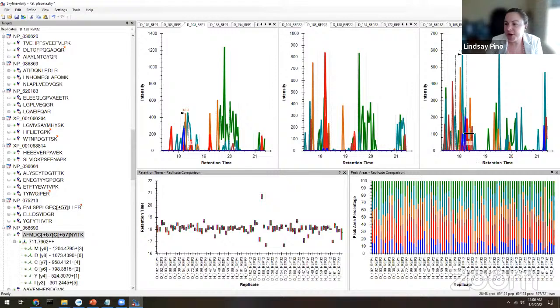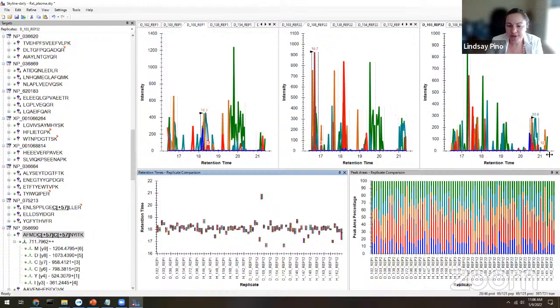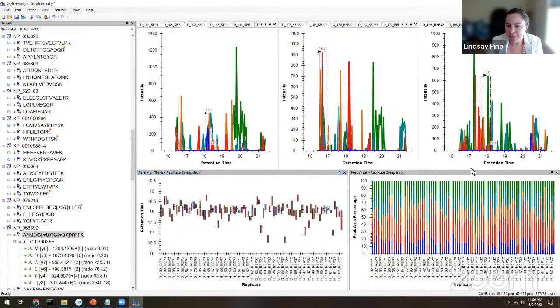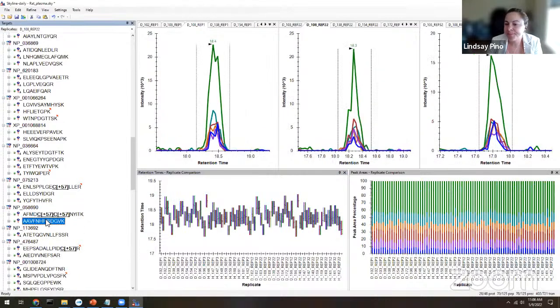This is so that I'm integrating the area. The quantitation is going to be with all of this same mess as all of my other samples. So I would try to align all of the retention times to about that 18-minute mark. Some of these are maybe too early. Some of these are maybe too late. But I would try to integrate the same area for everything for this super messy peptide.